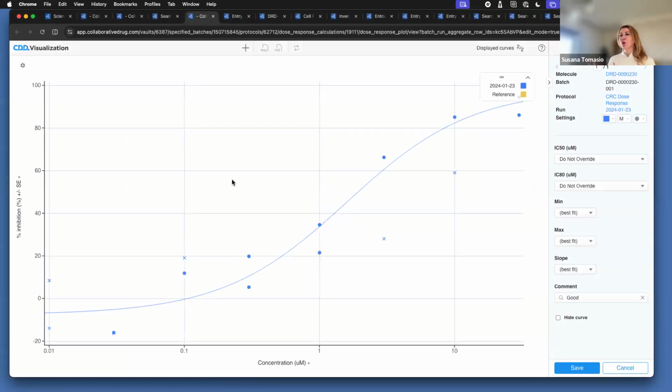This opens what we call the plot mini app, and this is where we can QC the data. These crosses here, these are some points that I had already flagged as outliers, but I can re-add them, and maybe I want to flag these 2 points over here.